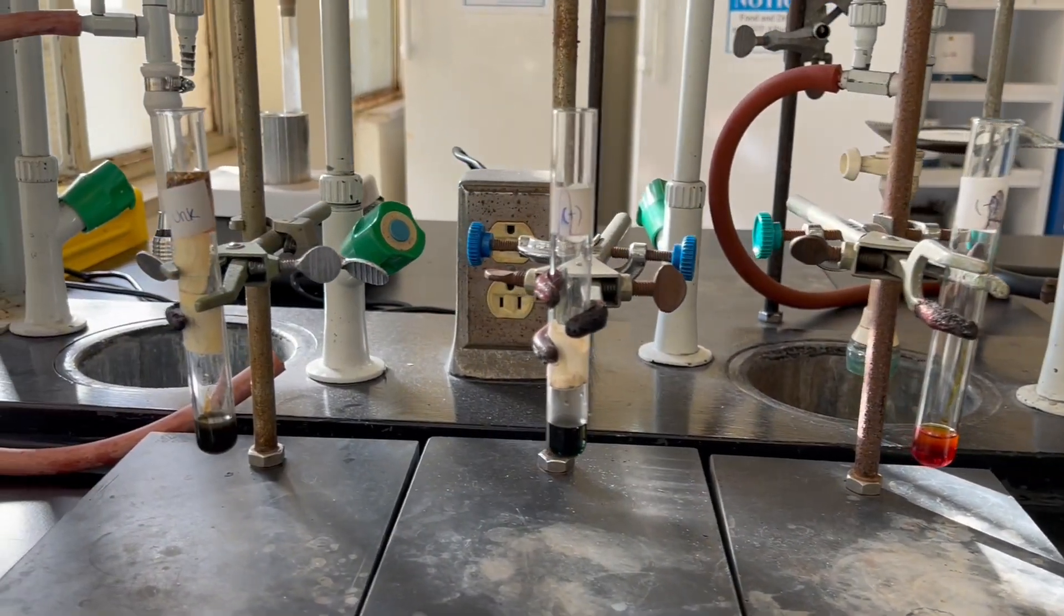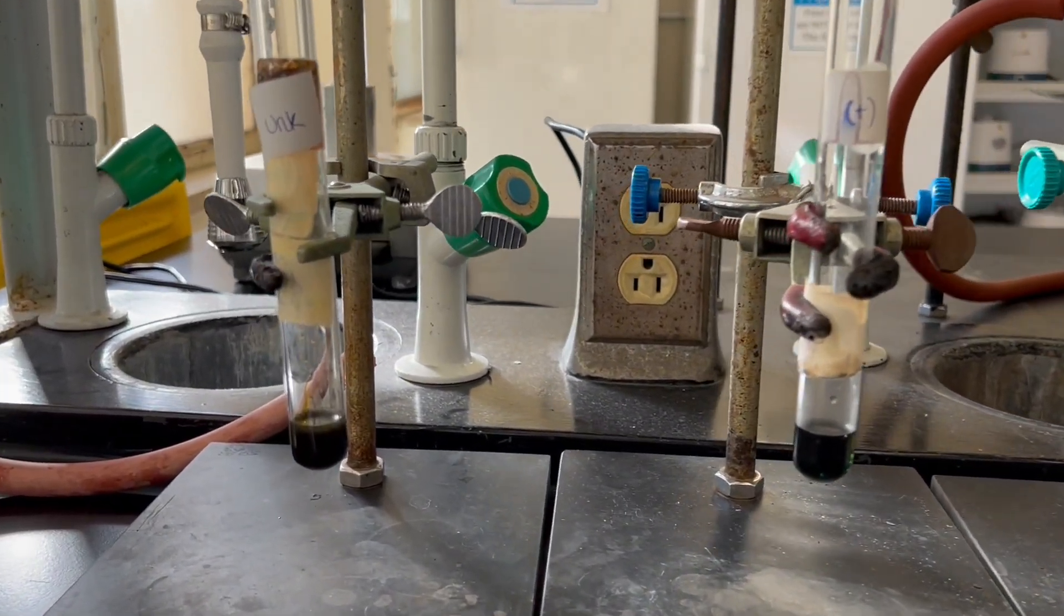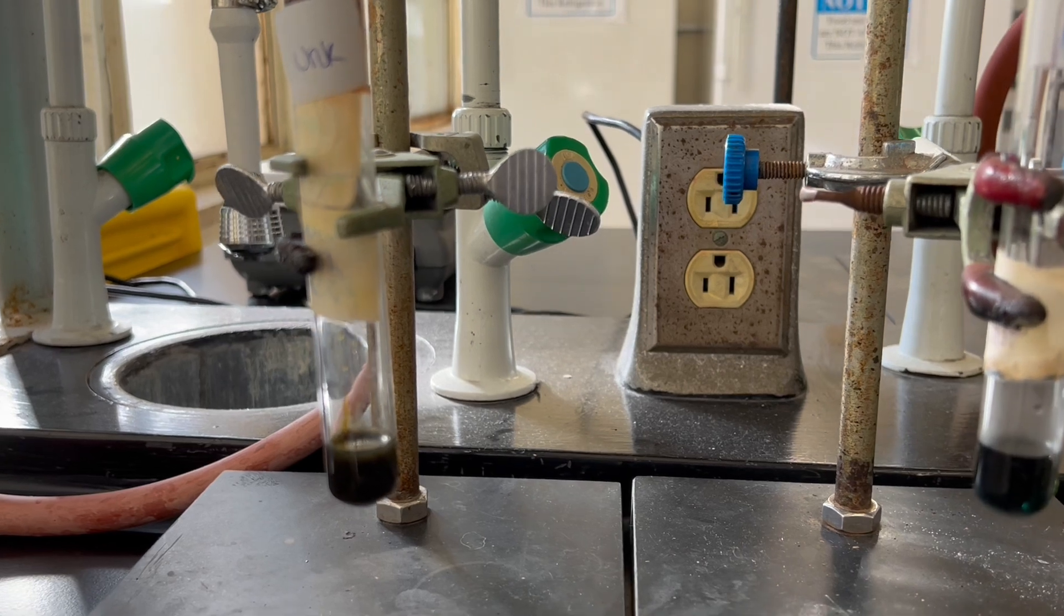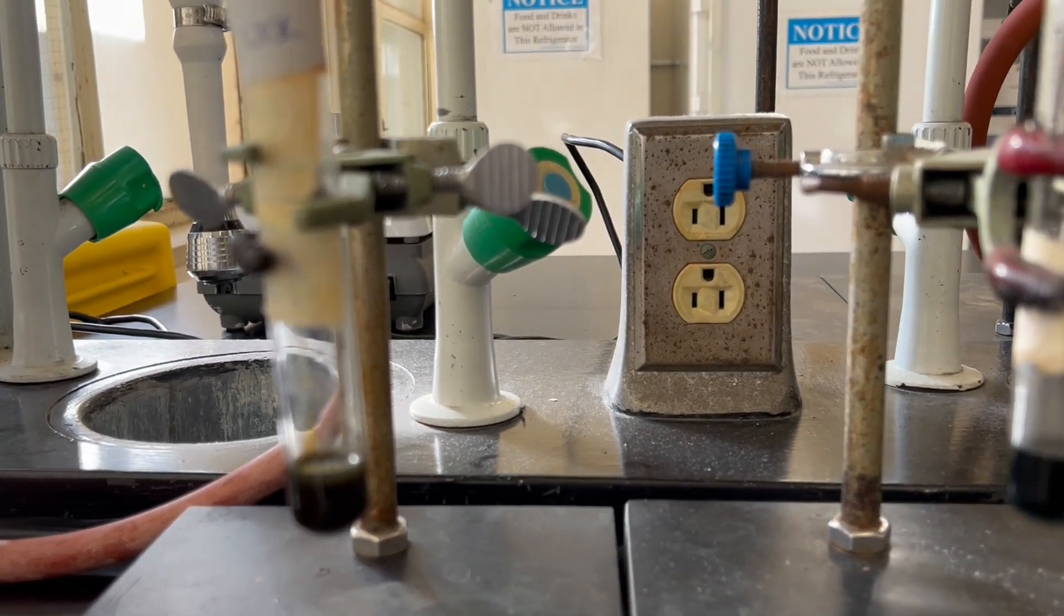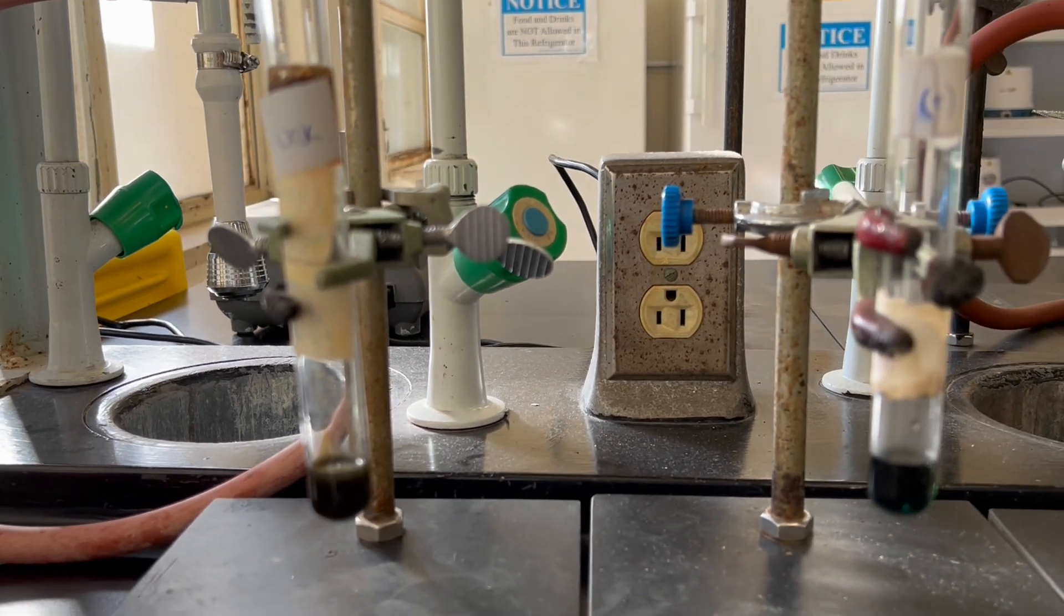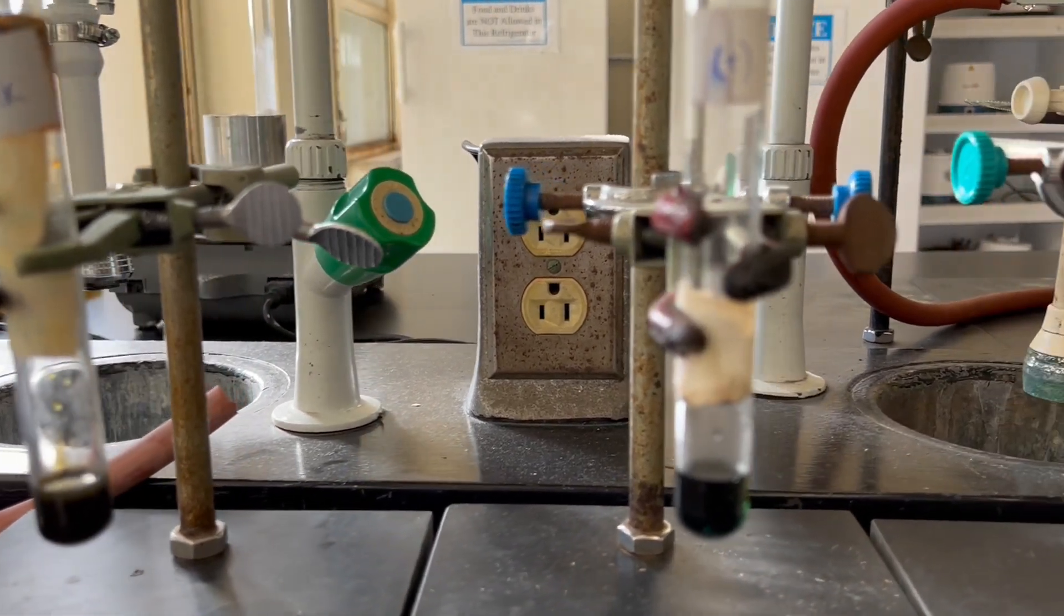As we can see, the test tube containing our unknown shares a very similar dark shade of green with the positive control test tube. This indicates a positive test, and our unknown might be a primary alcohol, secondary alcohol, or aldehyde.